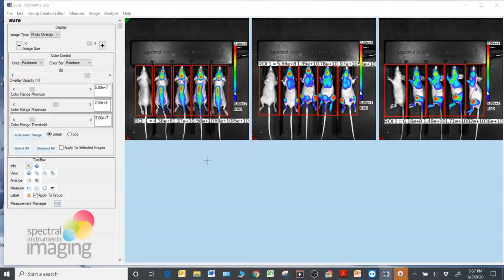And what you see now is the individual files opened up as a group with all of their ROI analyses intact. So if you wanted to have the option to go back and adjust the ROIs that you drew or draw additional ROIs, you very easily could.